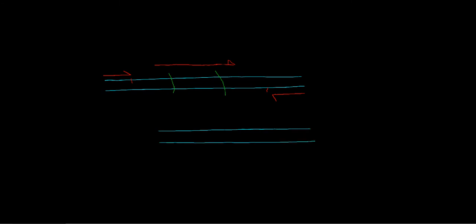And let's get that all annotated up. Let's just talk about this real quick. I'm trying to decide on a color, pink. So we have this forward primer. The combination of this forward primer here, which we'll call 2F, and 2R, are going to give us this chunk.